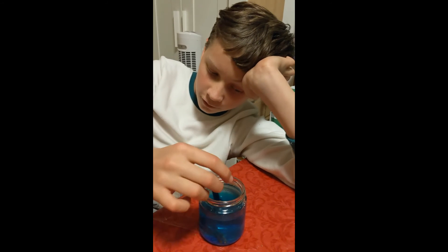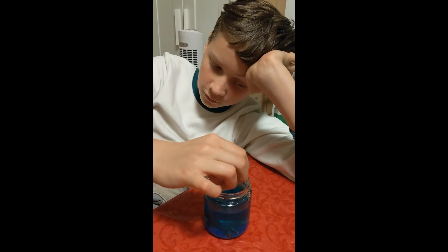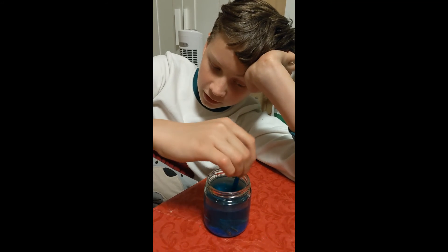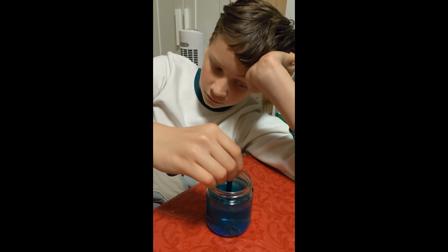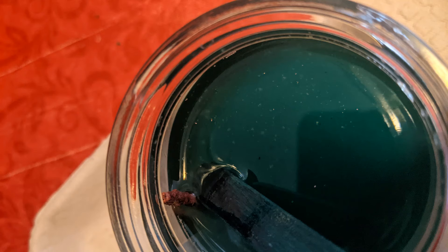Now I'm going to wait for about a day to see what has happened to the nail.